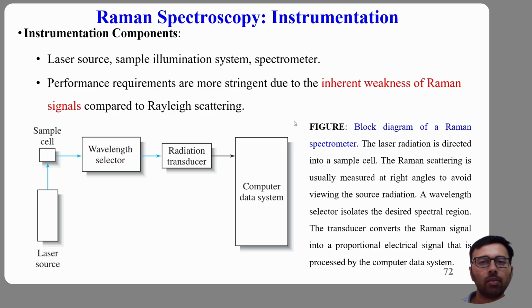We began with molecular vibrations, infrared absorption, Hooke's law, group frequencies, Franck-Condon transitions, FTIR instrumentation, and Raman scattering. We explored rotational spectra, vibrational spectra, polarizability, selection rules, and quantum mechanical transitions. Today, we bring all that theory together and step fully into the analytical laboratory. Today's lecture focuses on Raman instrumentation, sample handling, and real-world applications.